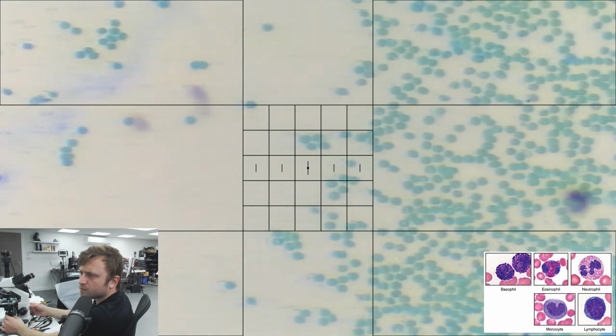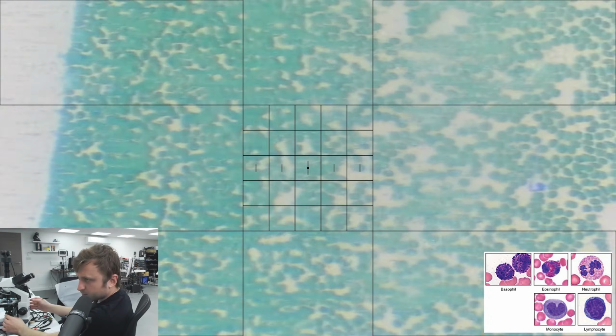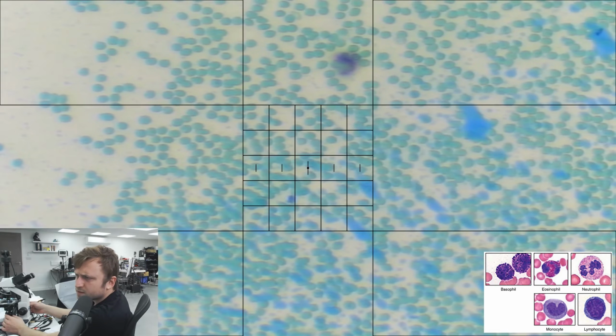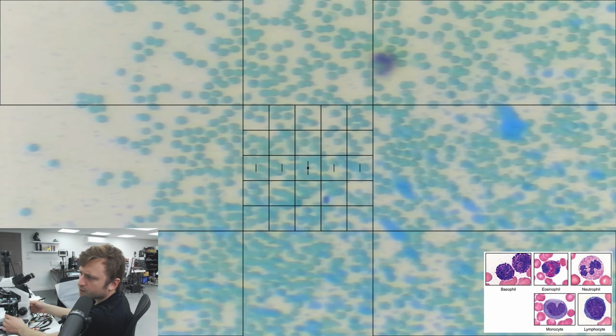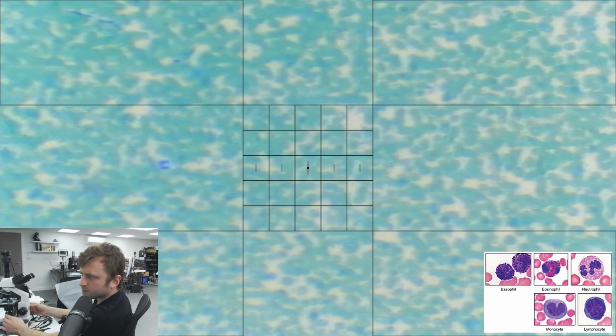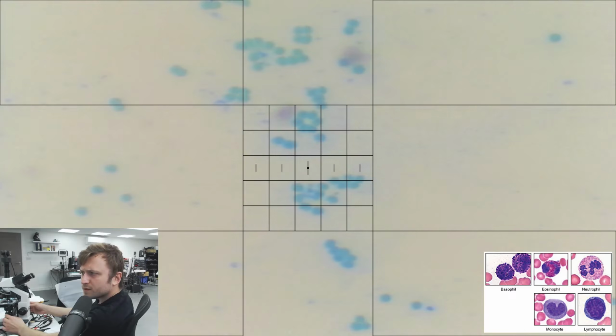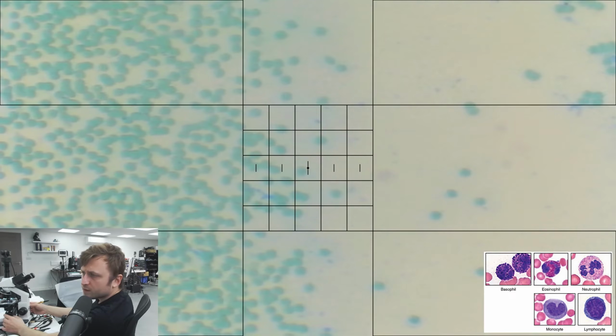Neutrophil. Debris. 1 neutrophil, 1 unknown. And continue down. Neutrophil. Is that a lymphocyte or just debris? I'll put it under unknown. Continuing. Neutrophil. Don't think that's one. Lymphocyte. Oh, a pretty hexagonal pattern above. Top center grid. That's cool. Okay, we're going to move down.